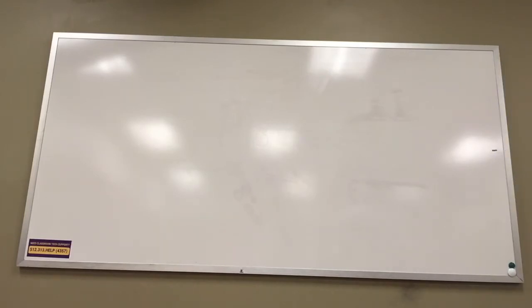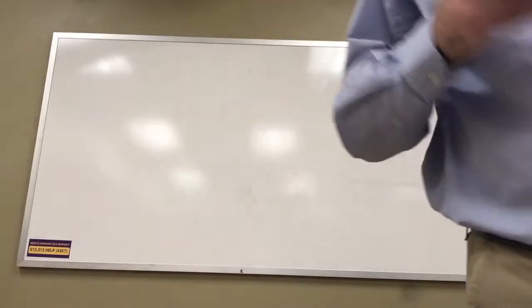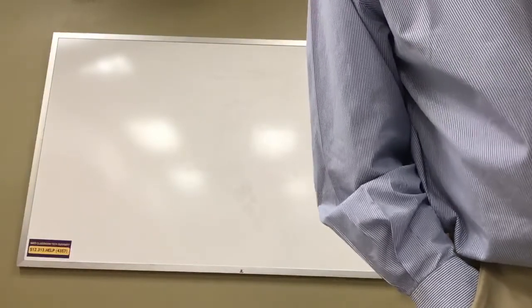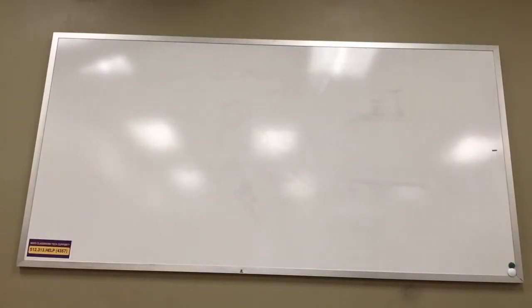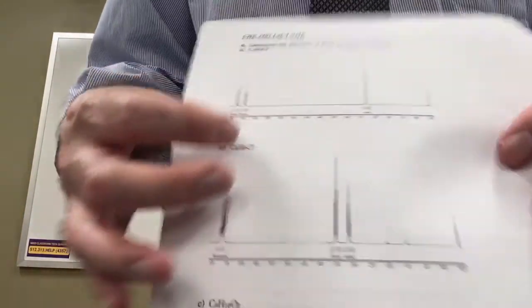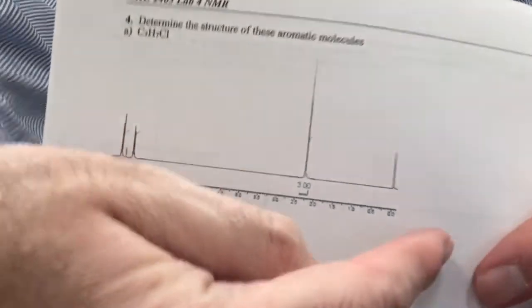So, did you say there are 3 signals or 4? I see 2. Yeah. Look, this guy right here. So those 2 separate ones? Depends what your perspective is. So the question is, how many signals are in this spectrum? That is our standard.